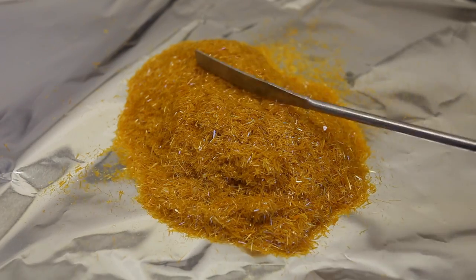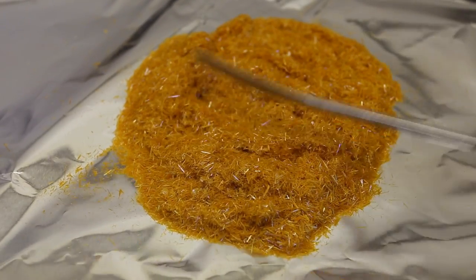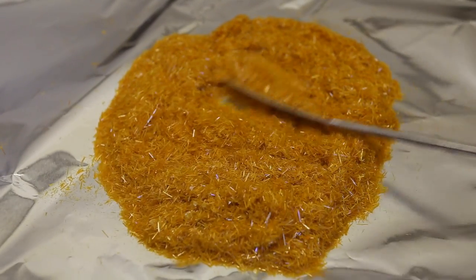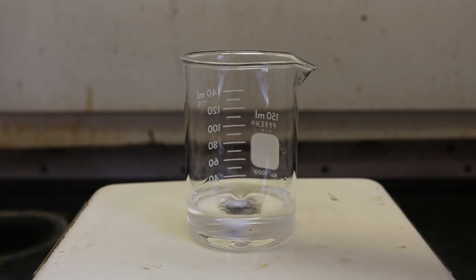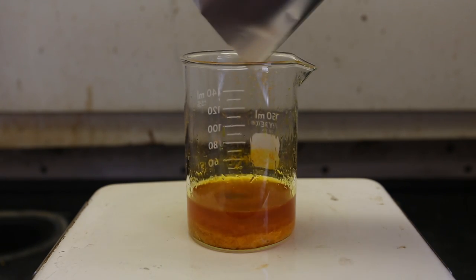This is what the final product looked like, and you can see that it is significantly contaminated with the ortho isomer due to its evident orange color. Also, the melting point was about 25 degrees Celsius below the theoretical 145 degrees. I then took my significantly contaminated crystals and decided to do an ethanol recrystallization.